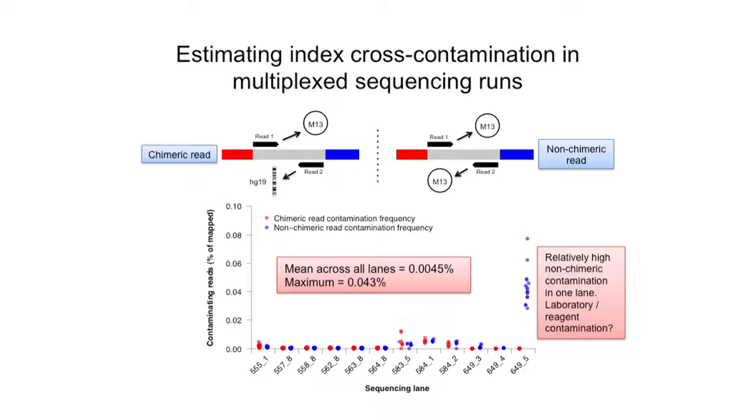So it's still relatively low, but this suggests that maybe, and I think that the non-chimeric contaminants could be laboratory contamination. So some carryover in a pipette or something. And so in general, this type of contamination seems to be low in our system, but you may have kind of a jackpot effect where some event in the laboratory could result in higher levels of contamination.